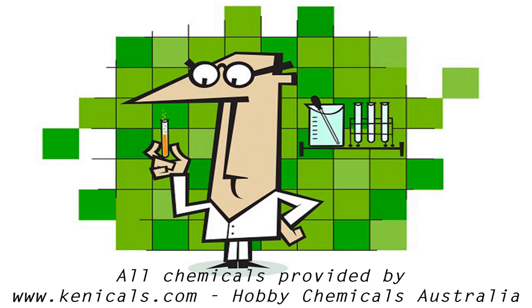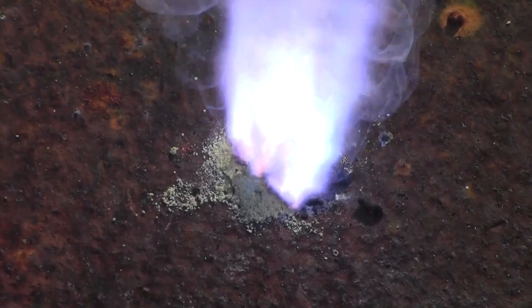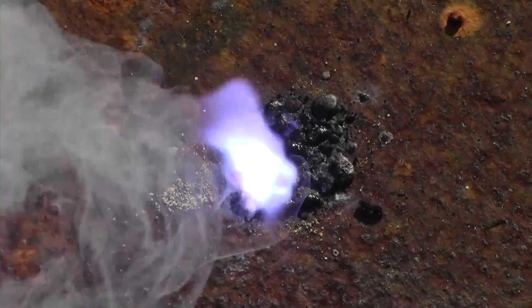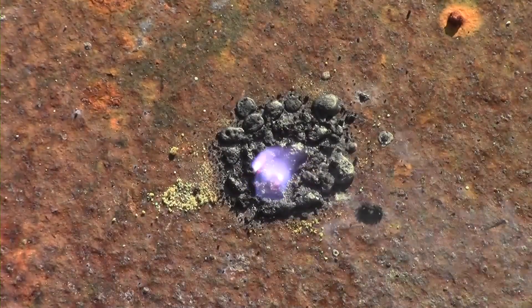All chemicals provided by kenicals.com, Hobby Chemicals Australia. Copper chloride is one of my favourite chemicals due to the property that when it is added to a fire it burns with a brilliant blue colour, and it is used in blue stars in the pyrotechnics industry. In this video I'll be showing you how to make it with three methods.